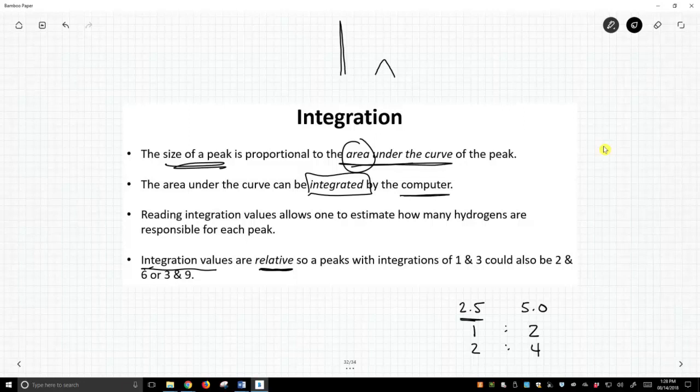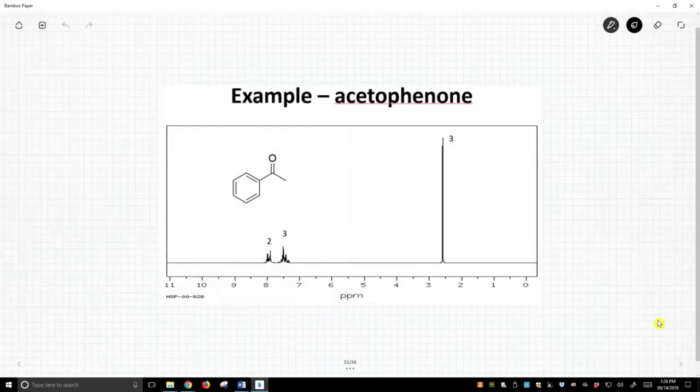Let's see a little bit how this works. We'll look at two sample spectra. And here is an example. This is a molecule acetophenone. Let's draw in all the hydrogens. These three hydrogens by symmetry are identical, so all those signals will show up together as 3 hydrogens, 3H, and here they are. They're right down here. This is a 3H.